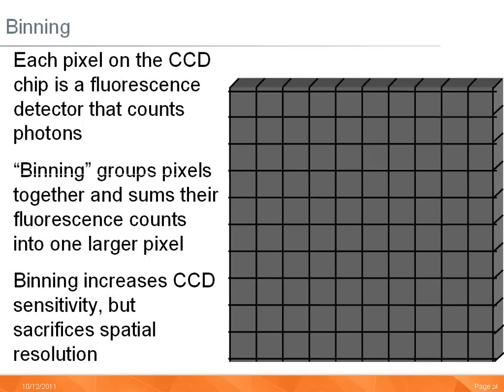The capture setting includes the option to change the bin setting. The graphic to the right represents a CCD chip, which is a sensor employed for all in vivo multispectral FX Pro acquisitions. A CCD chip is a grid of electron wells. When a photon strikes a well, it is converted into an electron and is held in the well through the acquisition. We can think of each electron well as a pixel in an image.